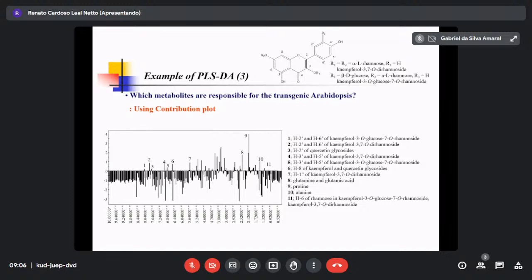In animal cases, I don't think you can find that kind of technical variation. If there is a variation, you can see the animals' characteristics, sometimes wrong swimming or wrong everything. But otherwise, in this case, too many signals come out, because the first one is random sampling, not transgenic, not wild type. Instead, it's mixed up, random sampling.